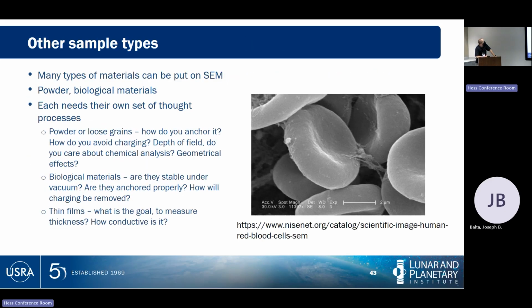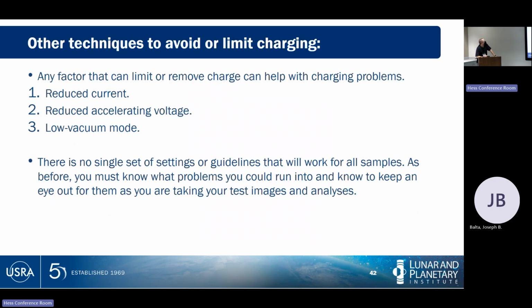Is this my last slide? Oh, 2 more slides. A couple more slides. All right. Other things to think through.